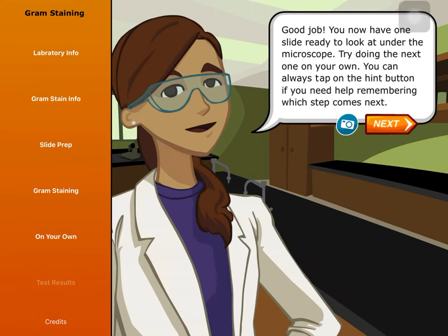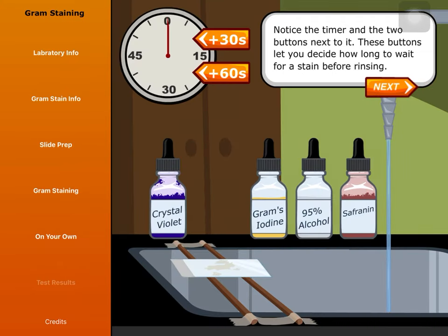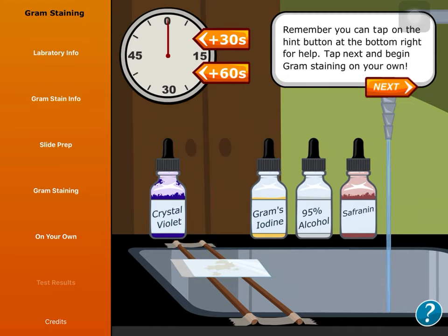Good job! You now have one slide ready to look at under the microscope. Try doing the next one on your own. You can always tap on the hint button if you need help remembering which step comes next. Notice the timer and the two buttons next to it — these buttons let you decide how long to wait for a stain before rinsing. Remember, you can tap on the hint button at the bottom right for help.